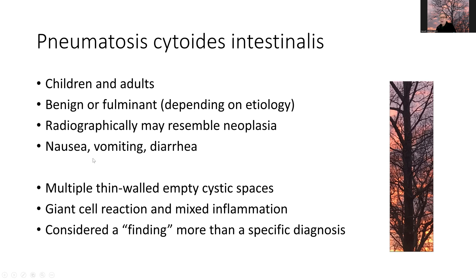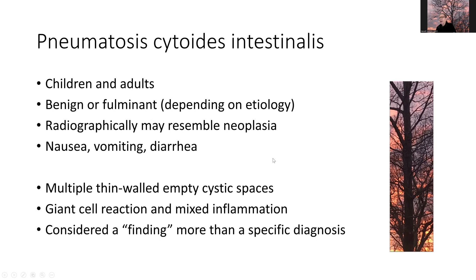The patients typically will have nausea, vomiting, and diarrhea. We've already illustrated the histologic findings with thin-walled cystic spaces and giant cell reaction. In general, this is really more of a finding rather than a specific diagnosis per se. So our final diagnosis on this case is pneumatosis cystoides intestinalis — a finding of note, not unexpected, but a somewhat interesting finding to see if you're not used to seeing these sorts of resection specimens.